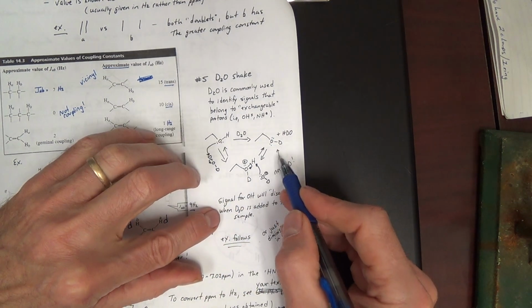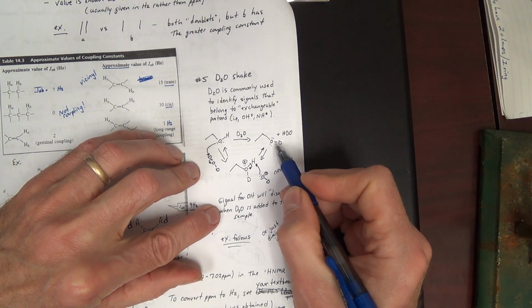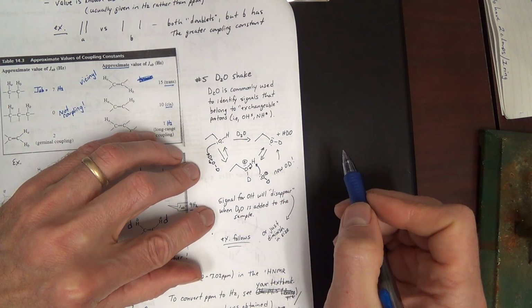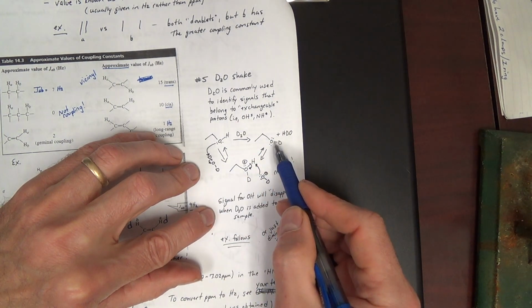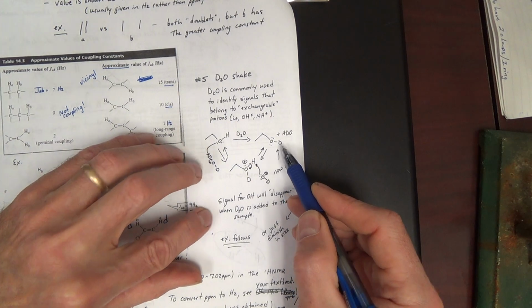Now, importantly, the signal for the OH, when you do this, will disappear because now it's an OD. And the OD is not going to give a signal in the proton NMR. OHs and NHs will do this chemistry, and thus they will disappear in the NMR.